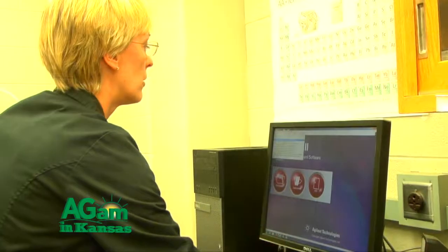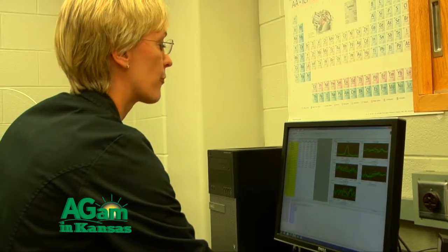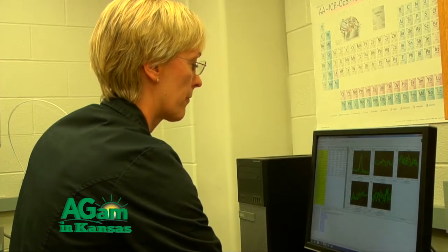That's a very good point, Jim, and actually we get that comment pretty often. Obviously, producers are looking at ways to cut costs as much as possible, but research from colleagues at the Department of Ag Econ here at Kansas State University shows that soil testing perhaps is the one thing that is even more important under these conditions of low grain prices and tough economic situations. That's almost counterintuitive, but it's not really.